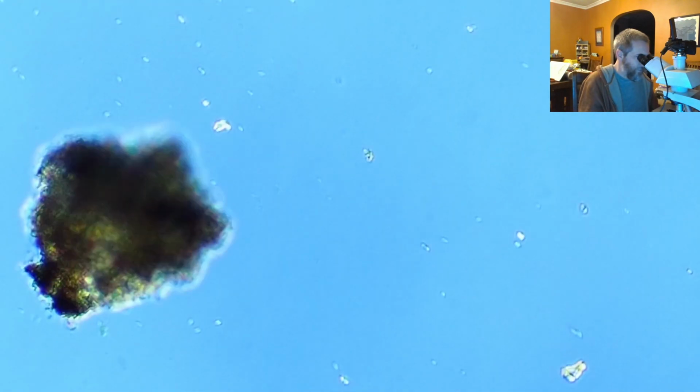She's way more knowledgeable about water bears than I am. But maybe if somebody needs a fix, they can come check out some of the water bears that we have here in these lichen samples, and also some of these rotifers that we have crawling around in here. I can just fill in for a little bit.